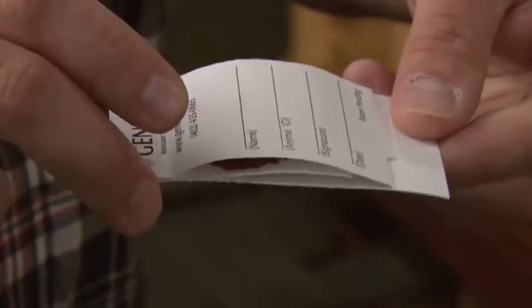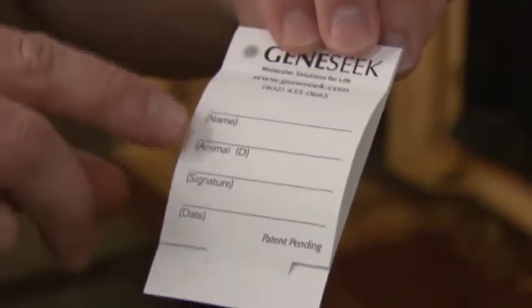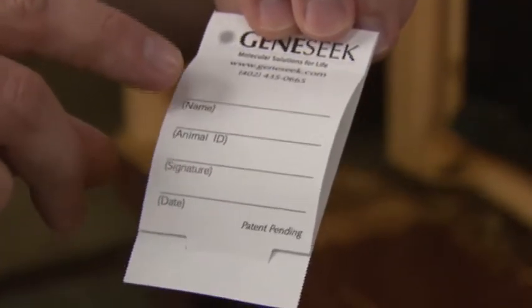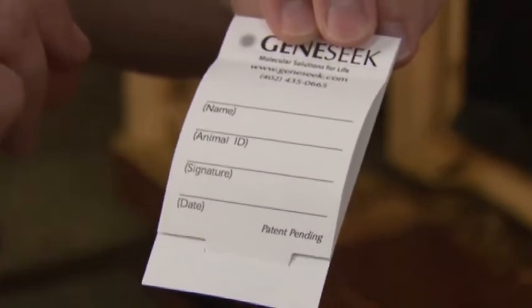As with any DNA sample, it's critical that this card and sample be free of dirt, debris, and manure. On the front side of the card, just like with the hair sample, fill out pertinent information — in particular the animal ID, either your name or your business's name, and the date that the sample was collected.